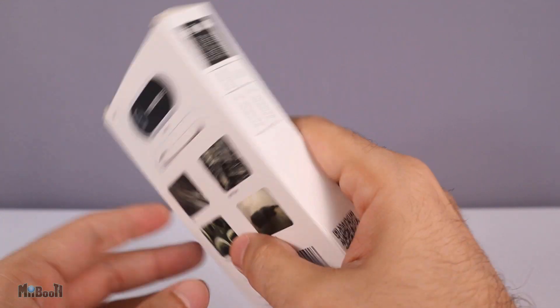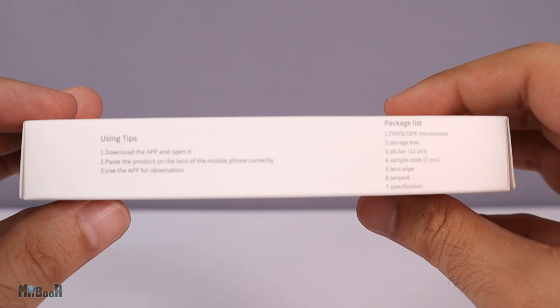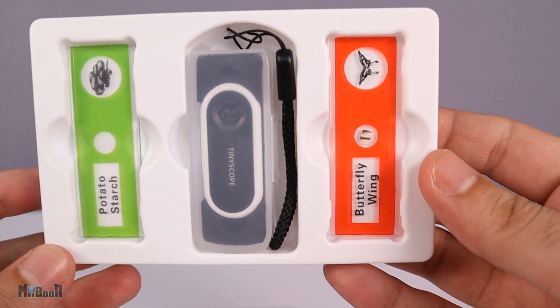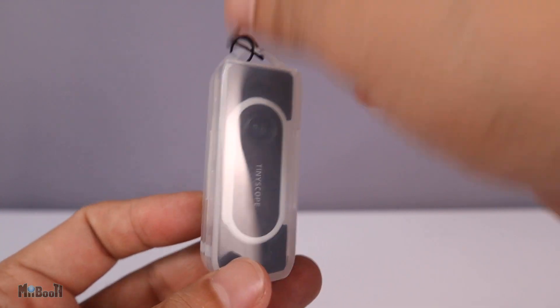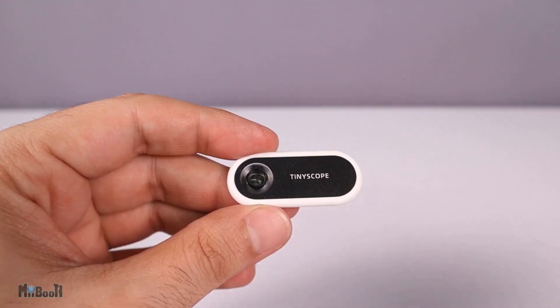On the sides we have the package contents and a QR code which opens a video tutorial on how to use the device. Inside the box we have the microscope, two sample micro slides — potato starch and butterfly wing — a user manual, a cleaning cloth, and a dozen donut-shaped double-sided stickers.